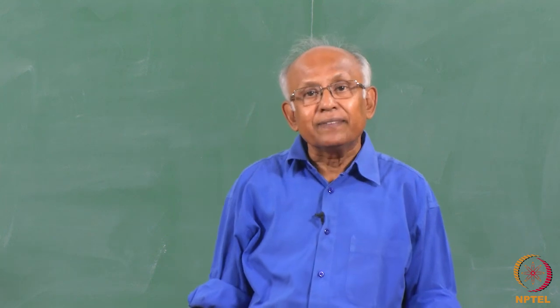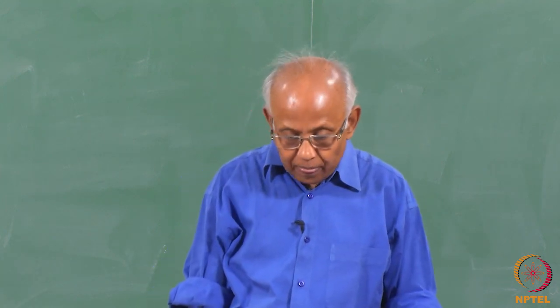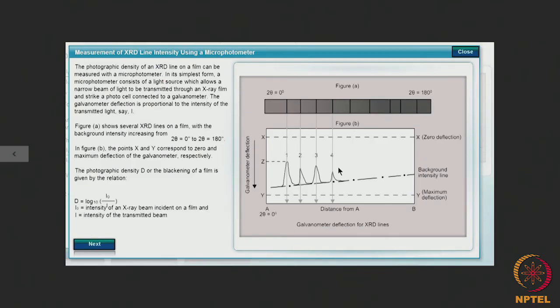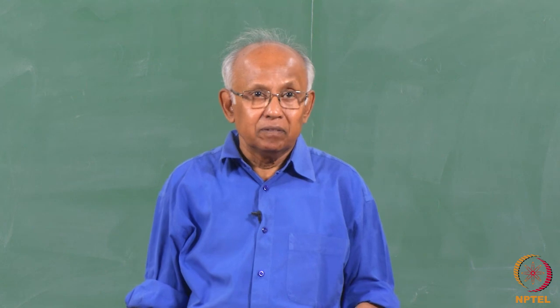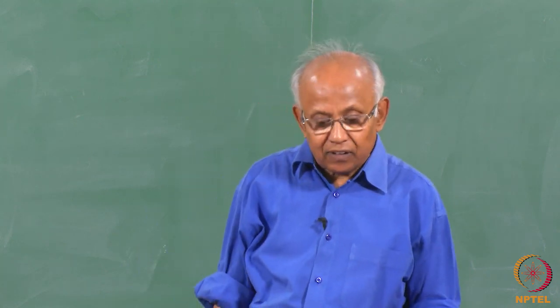Of course, this method can be extended to other systems also. You see, till now I talked about the diffractometer method. Sometimes in some laboratories people use the old Debye-Scherrer method too in order to find out the volume fraction, the quantitative measurement of the volume fractions of different phases in a phase mixture.